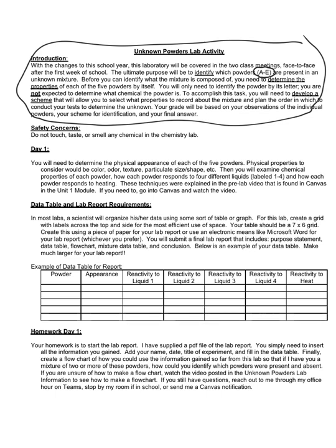In any chemical compound, once a new chemical compound is discovered, scientists will work on figuring out all of its physical and chemical properties so that if you have a substance found, maybe let's say at a crime scene, and they analyze it, they can cross-reference the properties of that substance, which is more than likely a mixture, with a database of all known chemical compounds to figure out what that mixture might be composed of.